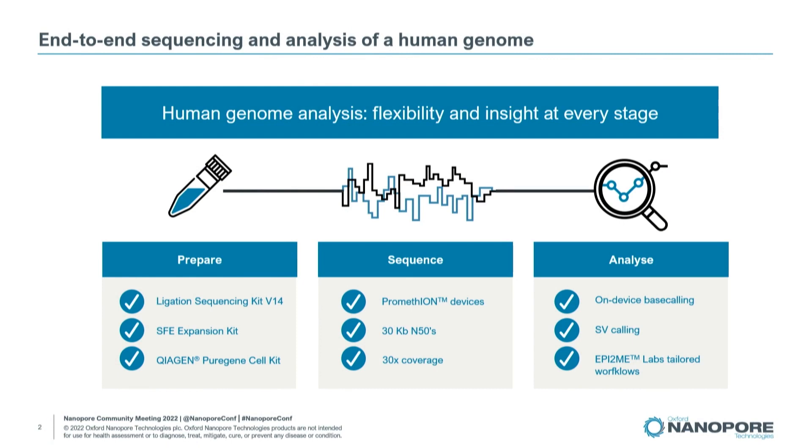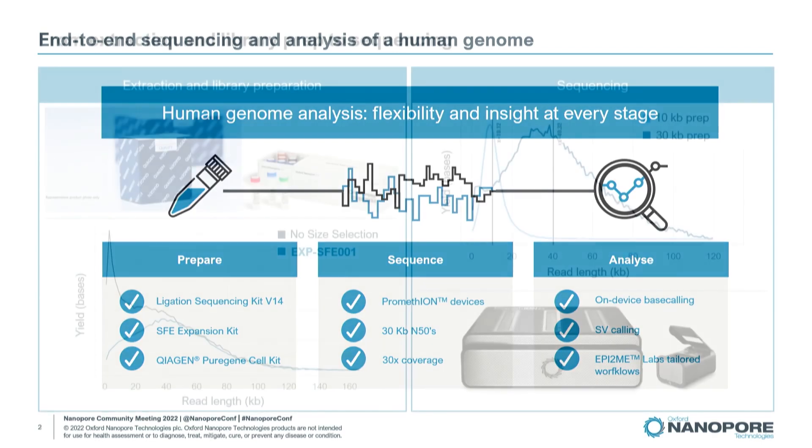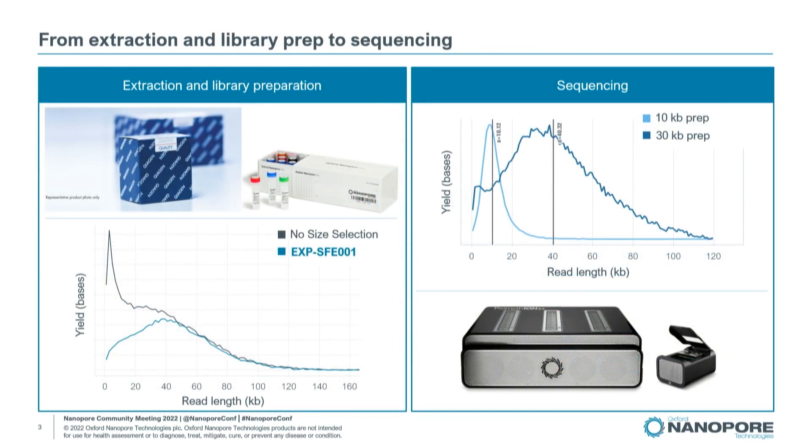This protocol walks you through the sequencing process from sample prep to data analysis. It starts with a DNA extraction from cultured cells and a library preparation using a Qiagen kit and our newest ligation sequencing kit, version 14, respectively.